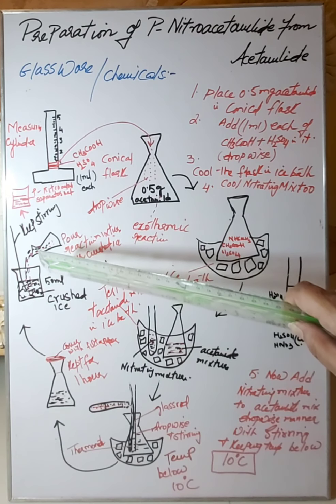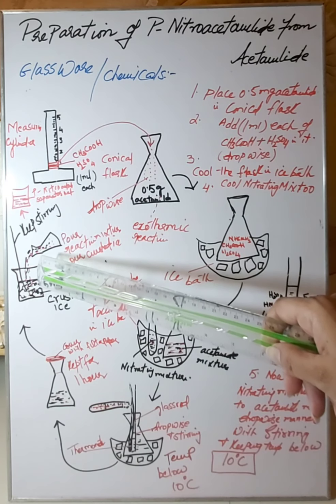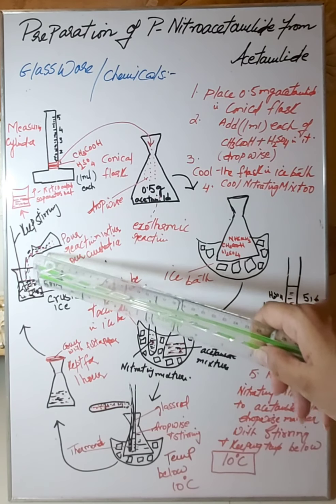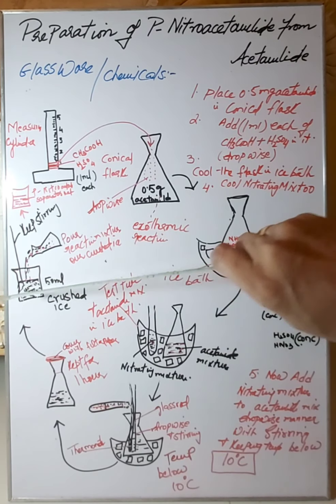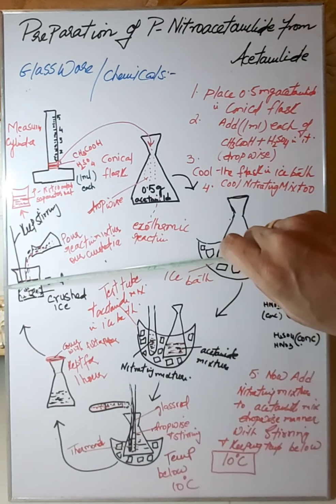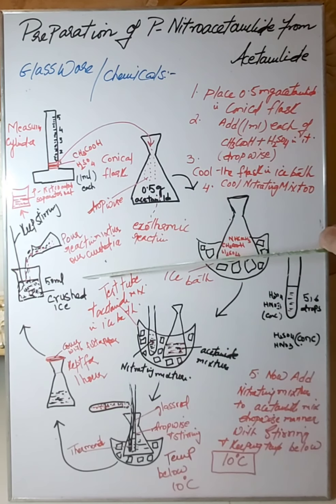They will separate out, and you will simply see them, very beautiful precipitates. They will be floating inside this crushed ice, right? So after that, you will again keep it aside for some time, about 10 to 15 minutes. Just let it be like that, right?